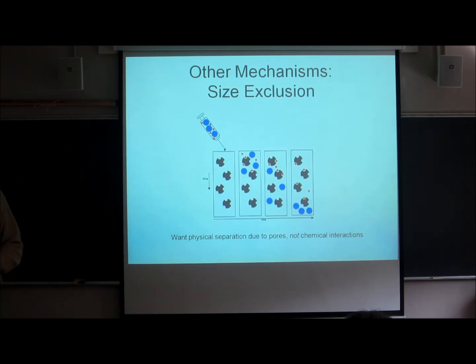Now, if you're a small protein and you've gone deep inside this path to get way down into the particle, it's going to take you longer to get back out again, isn't it? So in a column like this, the small proteins move through the column much more slowly than the big proteins. They bounce off, they can't get inside, so they come pretty much with the solvent.